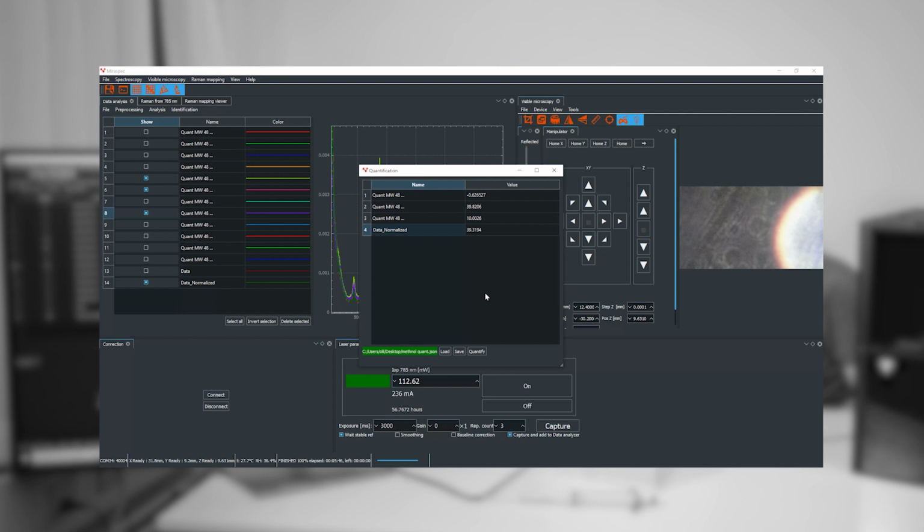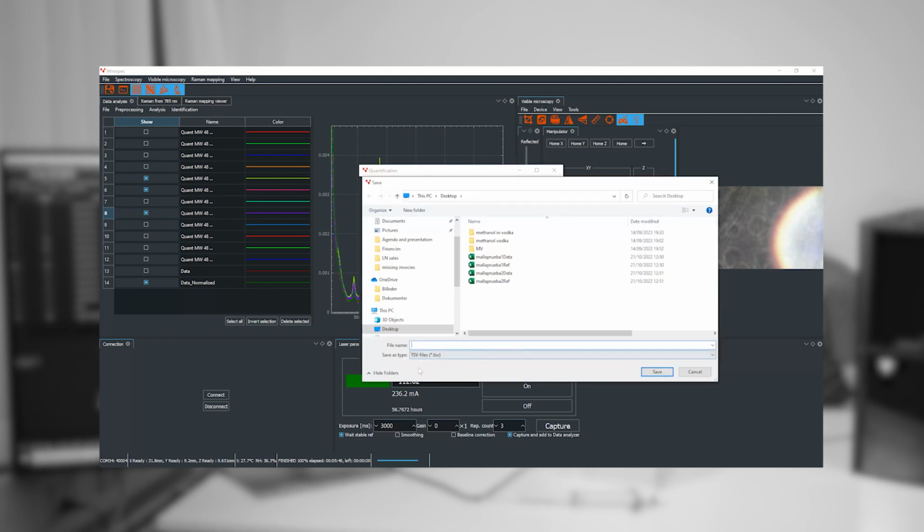One of them is 10%, then 39.8, some 0, some minus 0 a little bit, but it's within the error of the model. And how to save all of this? Just press save, and it will be like a table in a TSV file, the name of the sample and its predicted value.